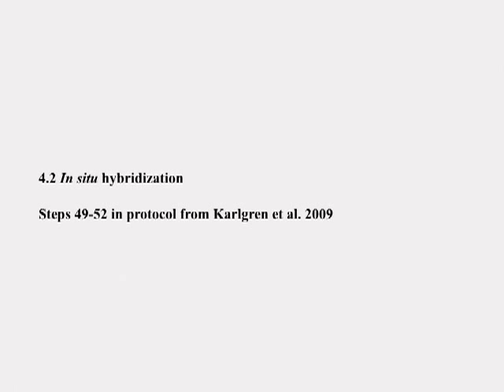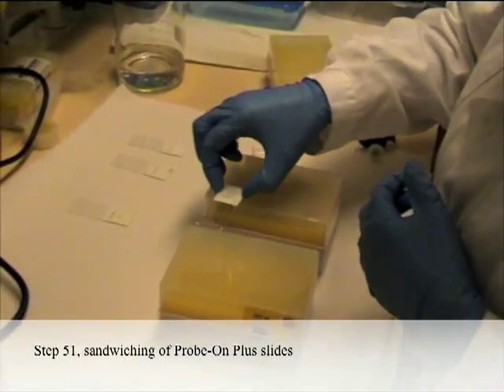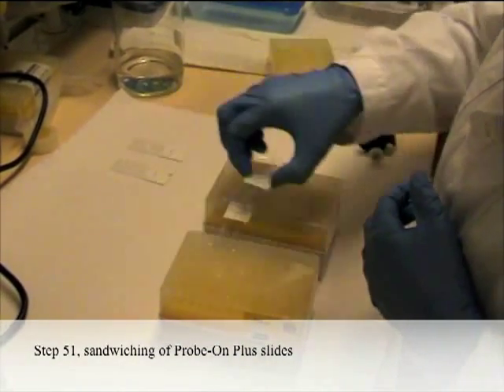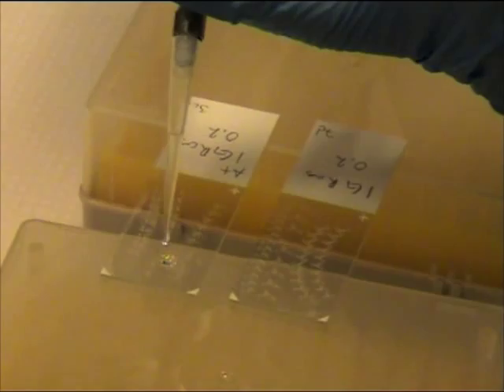4.2 In-situ hybridization. Steps 49 to 52 in the protocol. Step 51: Sandwiching of Probe-On Plus slides. The solution is viscous. Try to avoid bubbles.